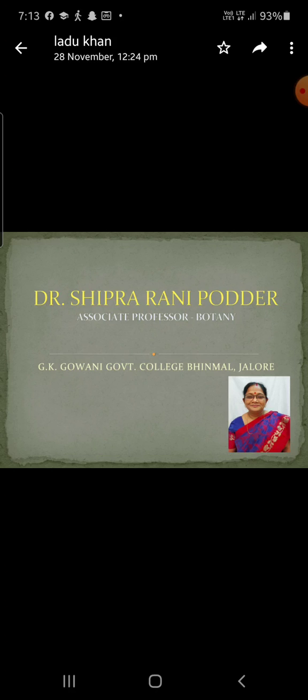Next to the hypodermis, there is a well-developed mesophyll tissue which is differentiated into palisade and spongy parenchyma. The palisade is a single continuous layer of columnar cells. The spongy parenchyma consists of several layers of loosely arranged oval or irregular cells that are confined to the wing. The cells of both the palisade and spongy parenchyma are rich in chloroplasts.